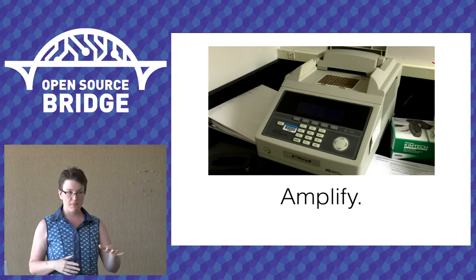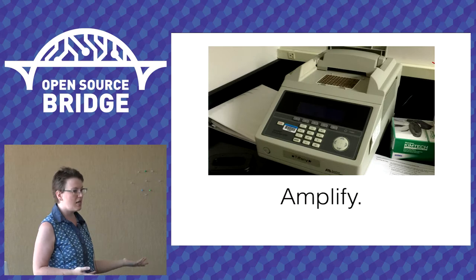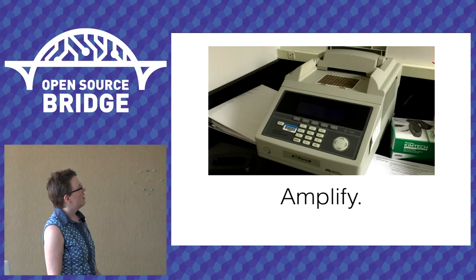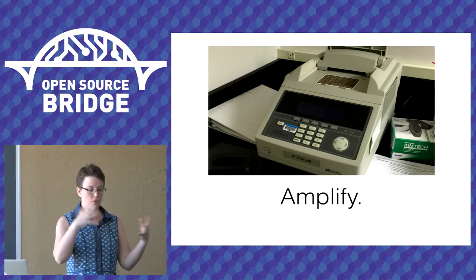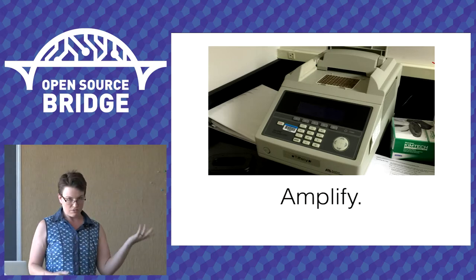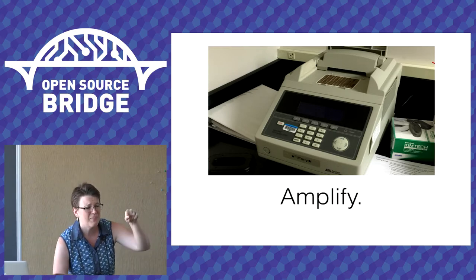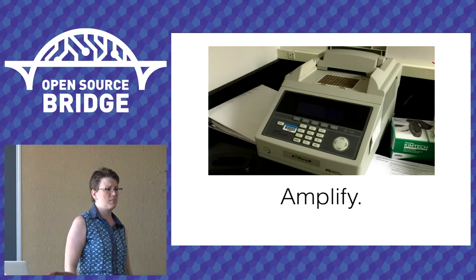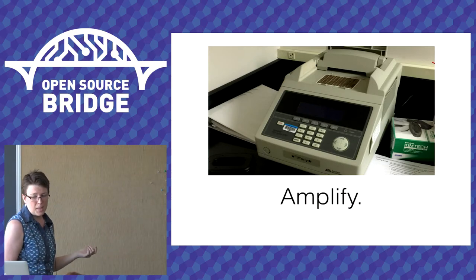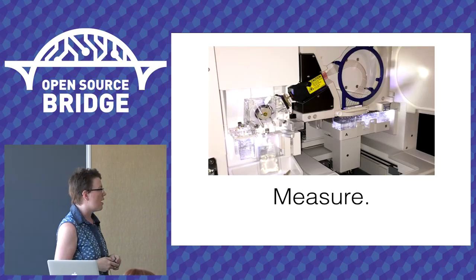So it's a chemical photocopier, like a photocopier or a computer: garbage in, garbage out. If you put a blank piece of paper on a photocopier and make 1,000 copies, you get blank. So if there's no DNA in the tube, the enzyme is just chilling out with nothing to do. If it's a crappy photocopy, many generations can't read it, it makes lousy copies. If the DNA is broken down, the enzyme's like, I can copy a little bit of that, but the rest of it's gibberish, I can't copy it.